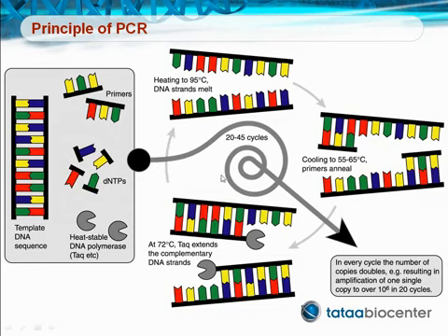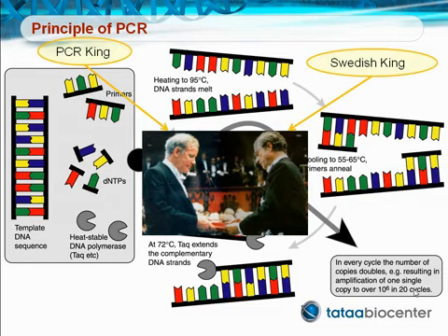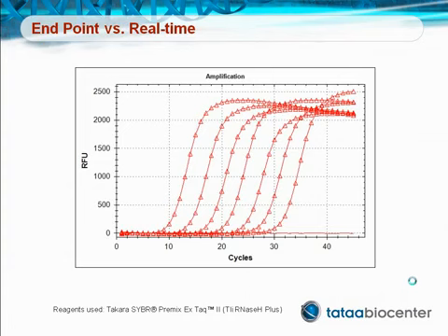The process is repeated over and over many times. After some 20 cycles, the PCR produces 1 million copies of every target molecule that was present initially. For his brilliant conception of PCR, Kary Mullis was awarded the 1993 Nobel Prize in Chemistry. PCR was refined by Russell Higuchi, who added a dye whose fluorescence increased upon binding to the DNA formed.